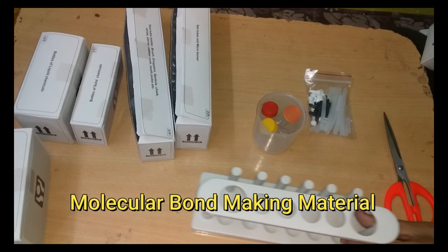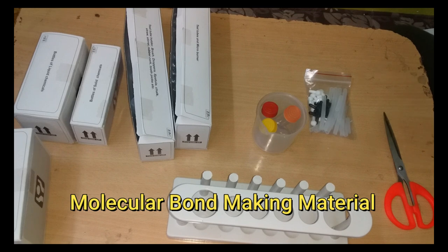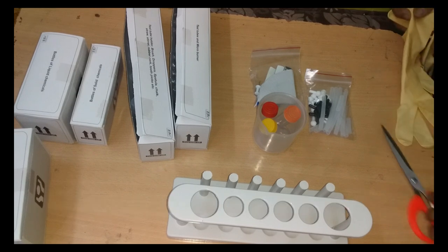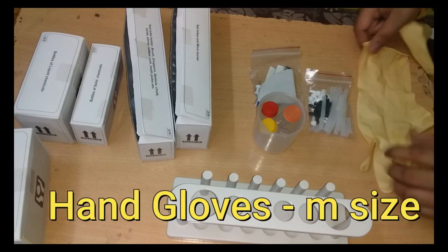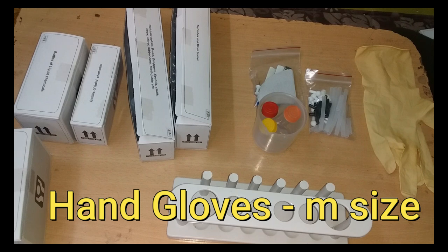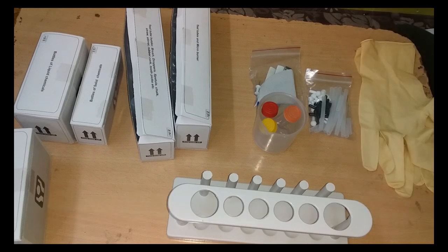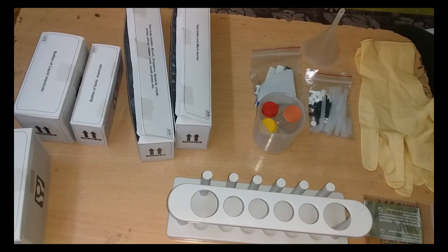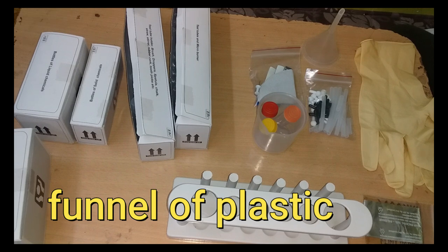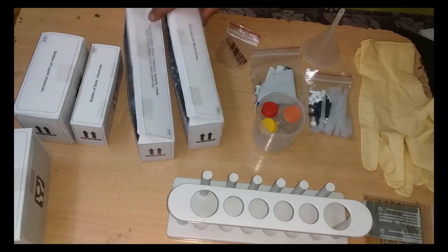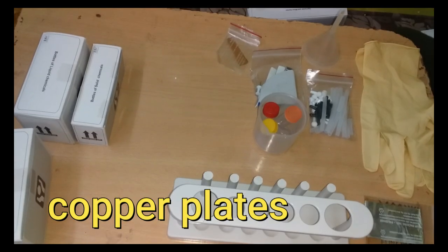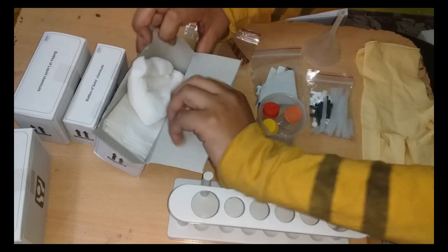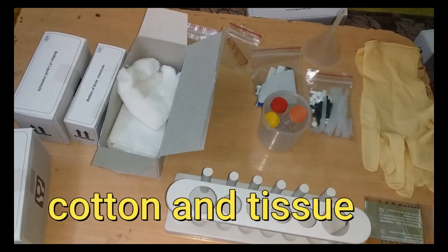And these are molecular modeling materials. This is all types of paper - pH paper, litmus paper. These are hand gloves, medium sized, and I think they're non-corrosive, plastic or rubber latex. This is aluminum foil, sandpaper, graphite rod, iron nails. There's a funnel of plastic. These are copper plates, zinc plates, cotton, and tissue paper.